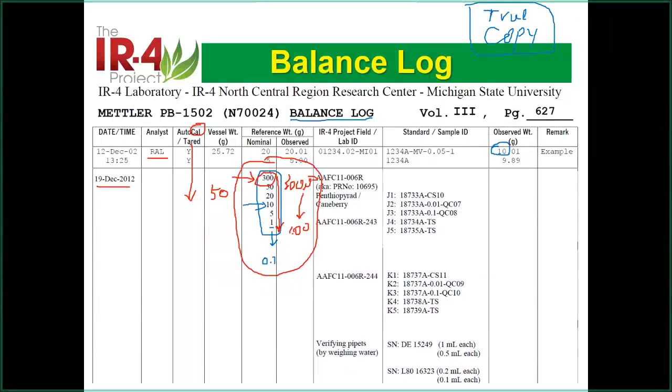But how can you get the data? For example, if Michael is doing that work in the morning, 10 o'clock, then I do the work using the same balance at 1 o'clock p.m. I do not have to do this because Michael did this already. So the balance is good. I know that. It's not just like a week ago, okay, Michael did the work. However, where you get the data, that's the question.